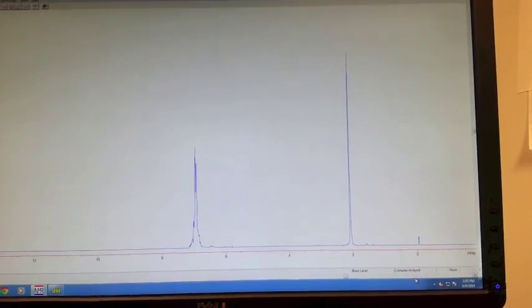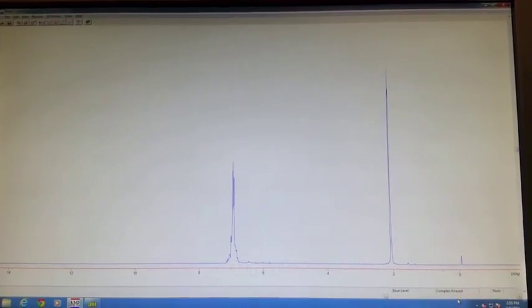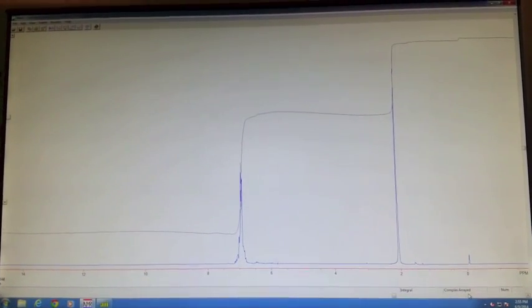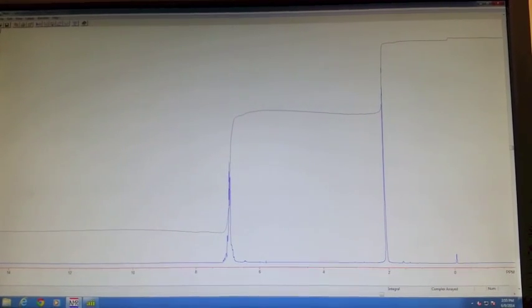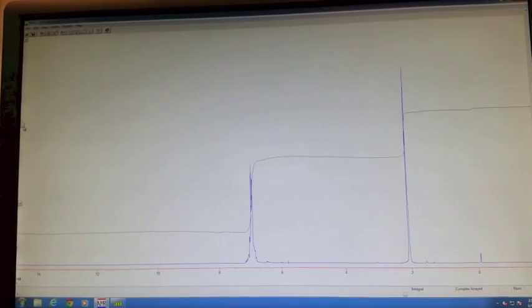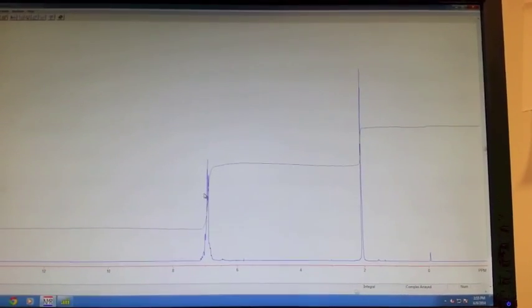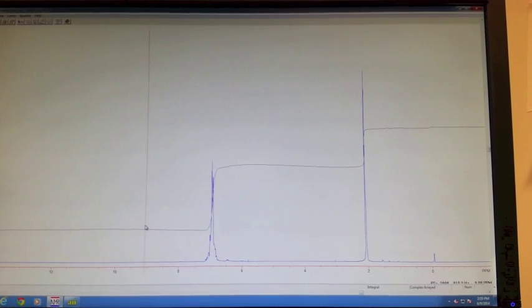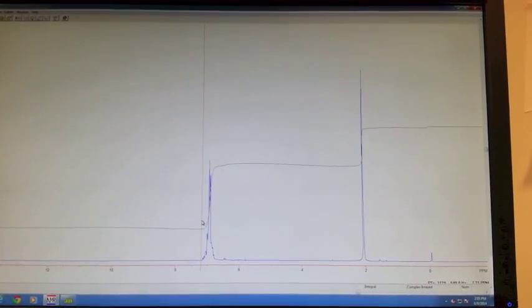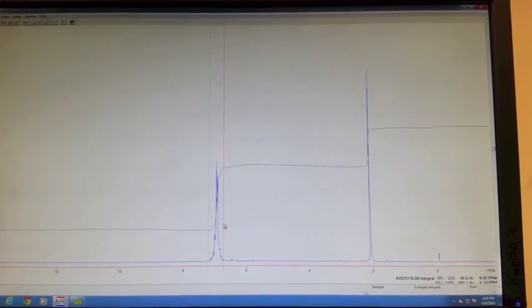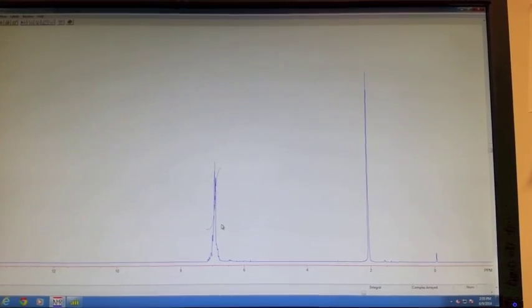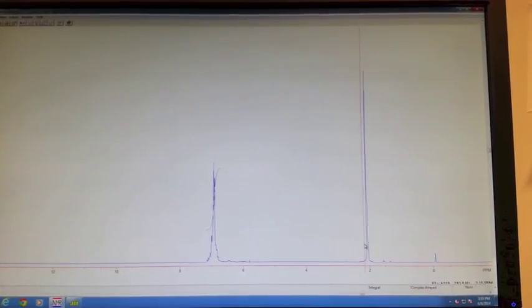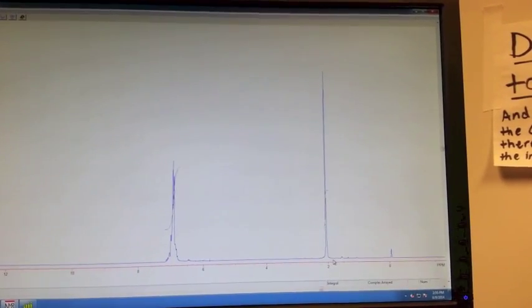The next thing you want to do is integrate your peaks. To do this, you want to enter the integral display routine, which is ID. You'll get your unbroken integral. If it's too big or too small, you can use the scroll bar on the left side of the screen to change it. Now what you want to do is click once to get the bar to show up. Then click once on the left side of the peak to set the left side, and then click another time on the right side of the peak to show where the right side ends. You want to do that for all the peaks except for the TMS peak.